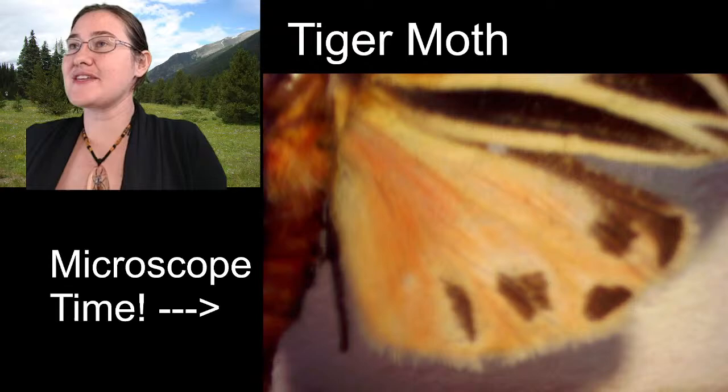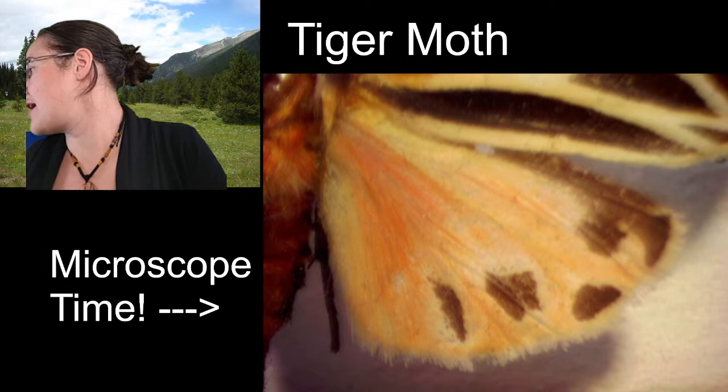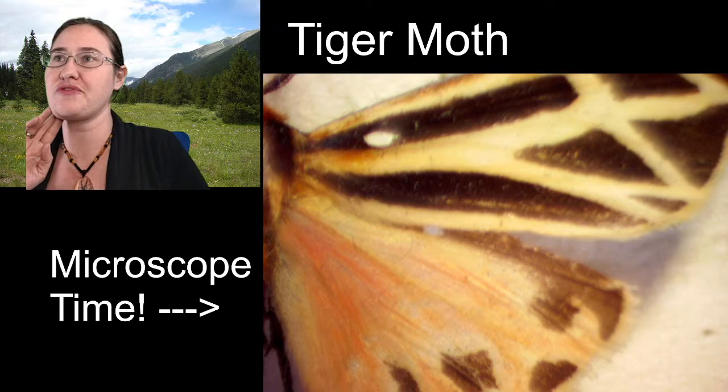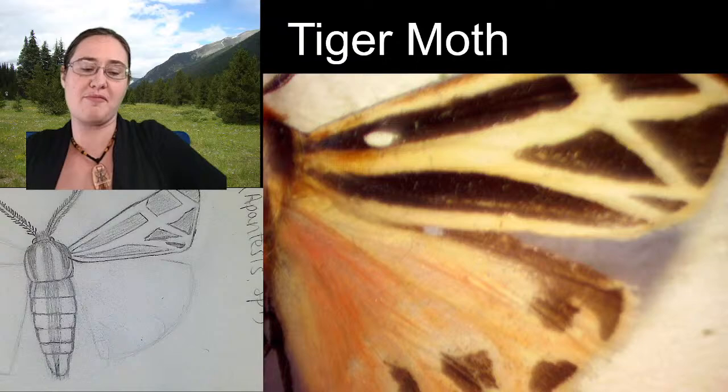All right, this is as zoomed out as we can get on the hind wing. If we want to, we can scooch it up just a little bit so you can kind of see where the hind wing compares in length to the front wing. For instance, like in my sketch, I'm going to be shortening up my hind wing just a little bit.